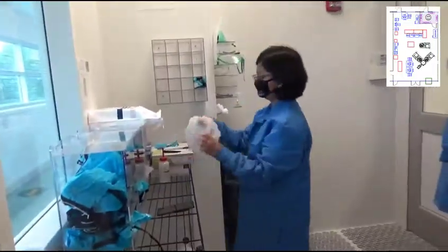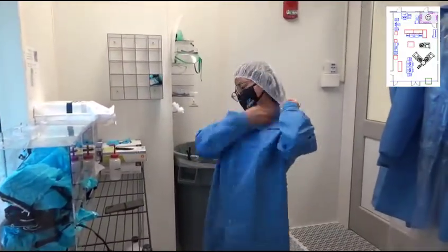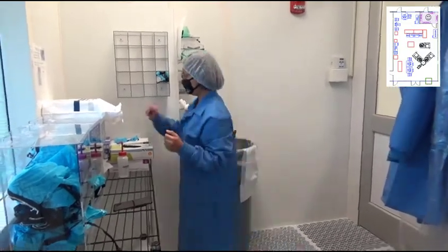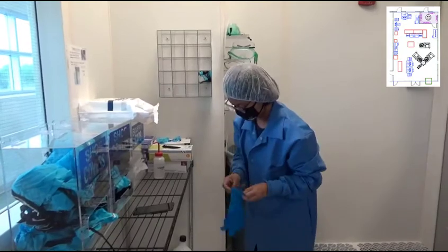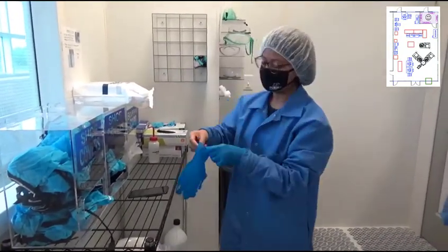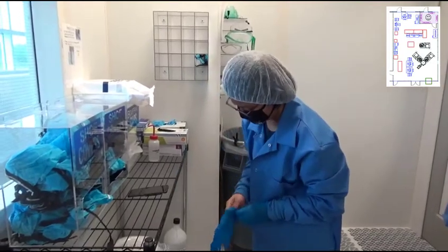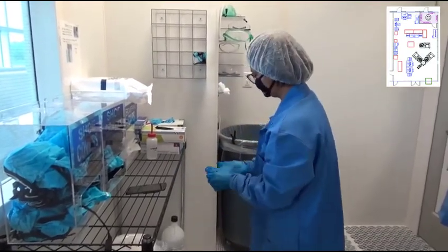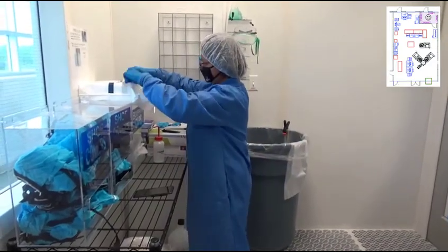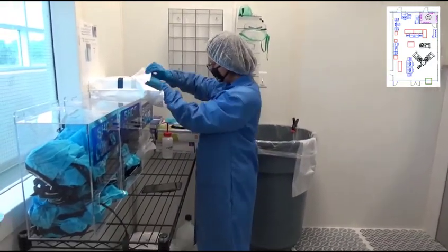when not in use. Then locate the bouffant caps and put one on your head, making sure to tuck all of your hair inside. Then make sure you have eye protection. If you do not have prescription glasses, put on your safety glasses. You can store your safety glasses in the cubbies with your shoe covers when not in use. Then put on gloves, of which various sizes are located in the gowning area.